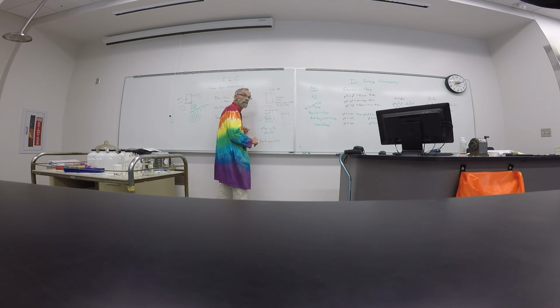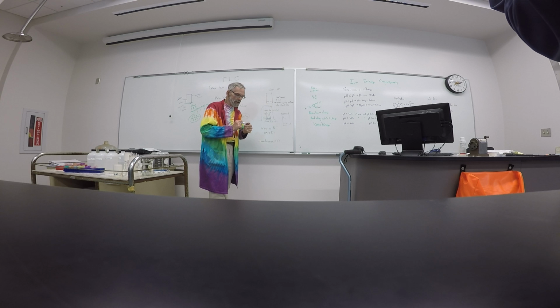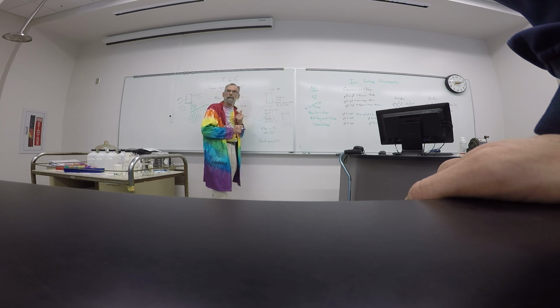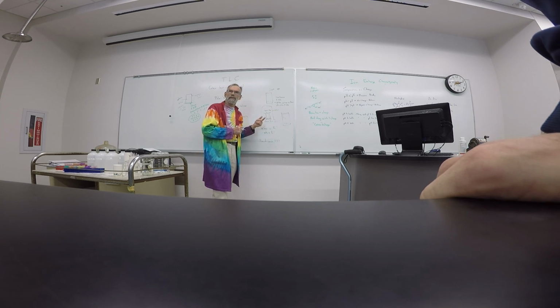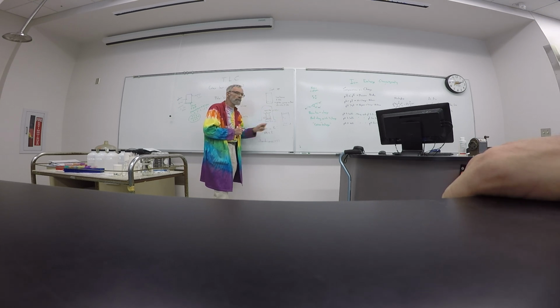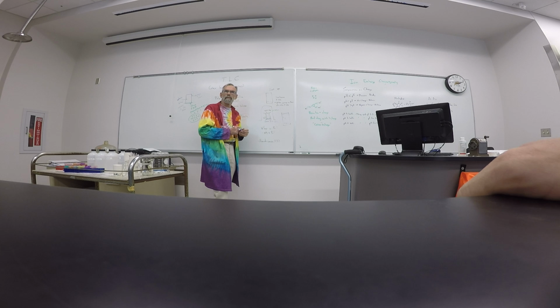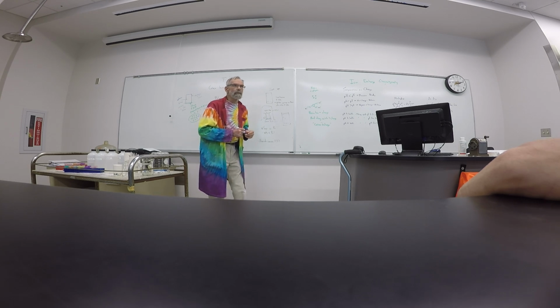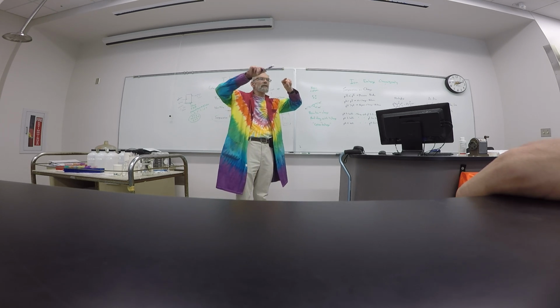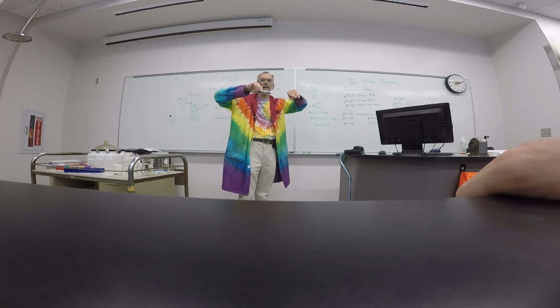Why do we have to use retention factors in this lab? What's the advantage of using retention factors? You have to do a calculation, but why are we going to use a calculation? Why can't we just measure the distance from the bottom to the top? So that it's standardized and it can be repeated. So it's standardized and can be repeated, and especially since each bench is doing a set of amino acids.